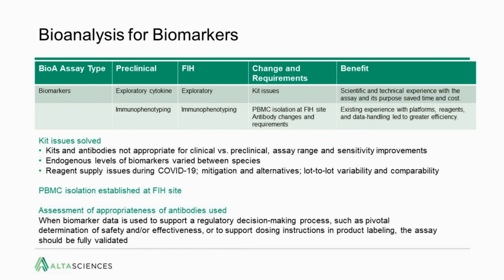Specifically with regard to the kit issues that were solved, kits and antibodies can sometimes not be appropriate for both clinical versus preclinical analysis, and assay ranges and sensitivity improvements are needed. As well, one has to consider endogenous levels of biomarkers that can vary between species.